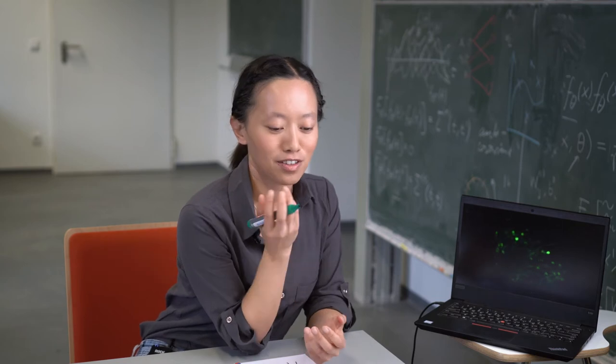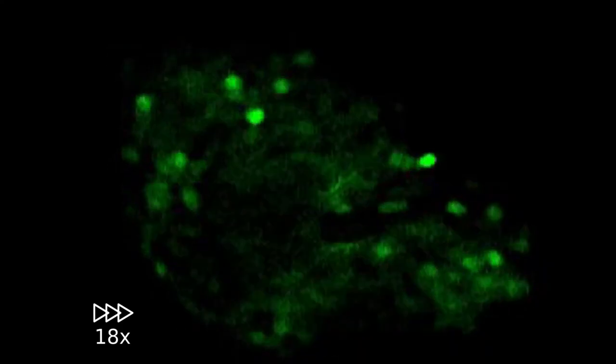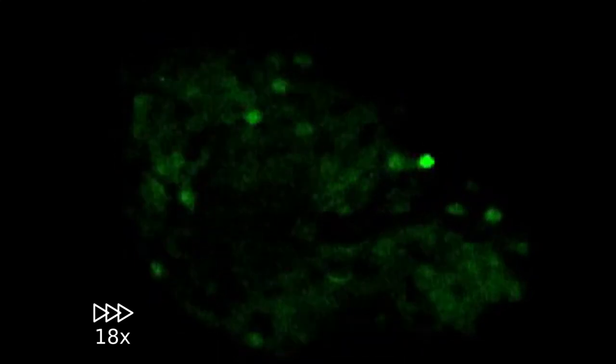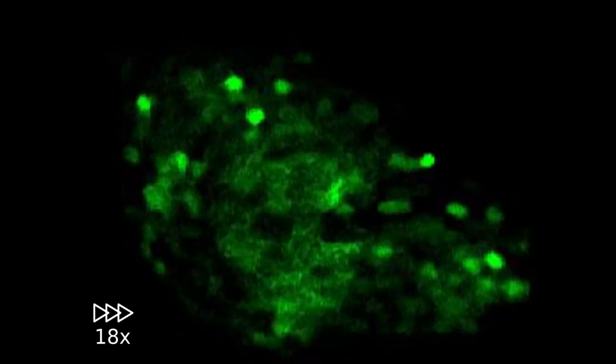Here you are seeing an example of the calcium imaging of a fruit fly brain region responsible for olfaction, the smell perception. Each of the circular patches here is a cell body of a neuron. When the neuron is active, the calcium ion concentration increases and the neuron glows.